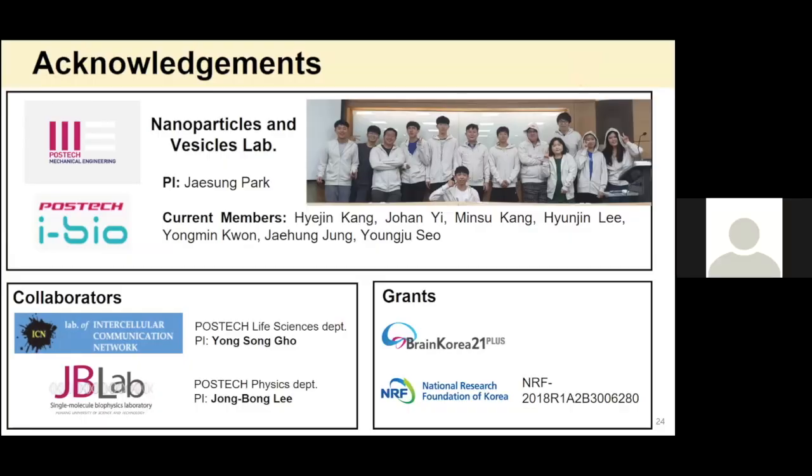So I see several questions here in the chat box. I'm going to call on Artem first. Yeah, hi, thank you. It's an amazing presentation, amazing technique. This is the way we can study vesicles at the level of single EVs. But as I know, there are several other commercially available equipment, for example ExoView, which is based on a very similar approach. So my question is, have you ever compared your data with some commercially available equipment?